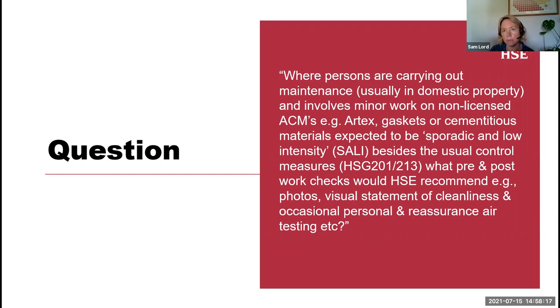But I should have said, actually, also with contaminated land, a lot of the attention is to do with providing reassurance monitoring, particularly if you've got residential areas or public areas around the outside. But I always say it's equally as important to do the on-site sampling where the source is, because to be honest, by the time it gets across to the perimeter of the site, all the asbestos fibres will be diluted.